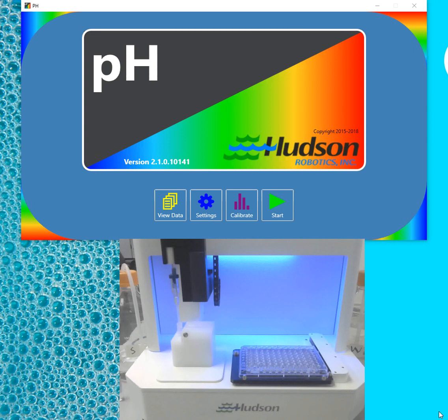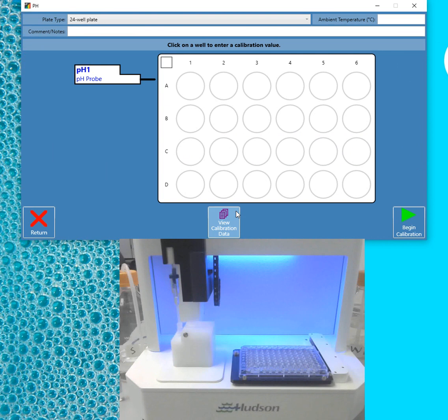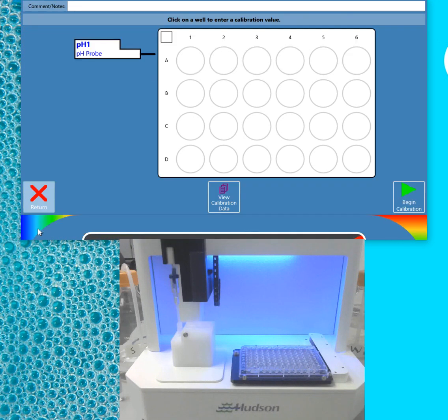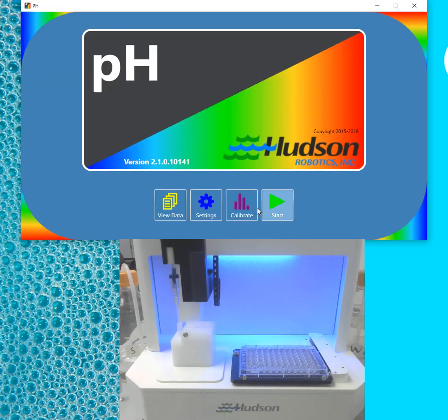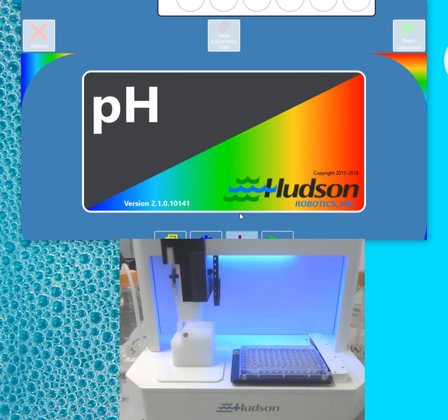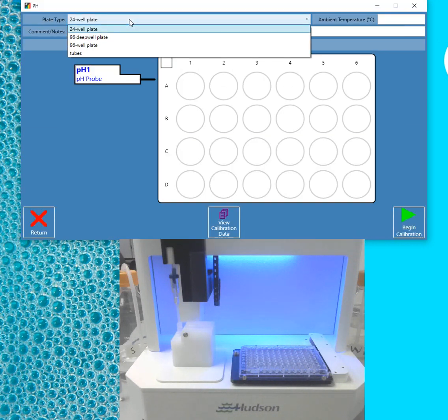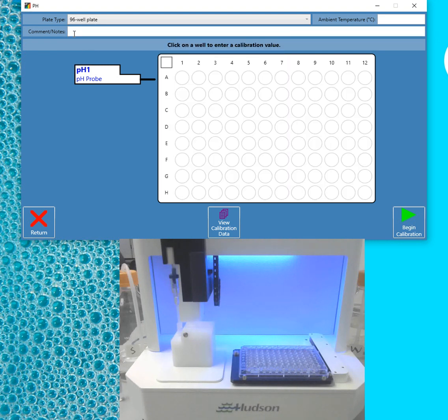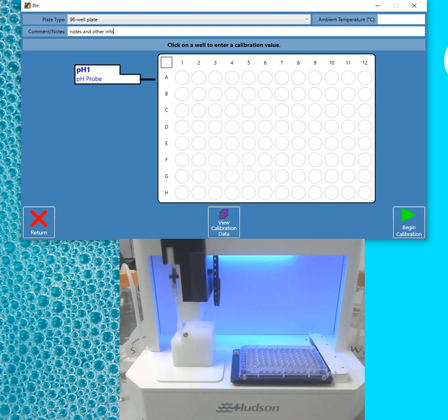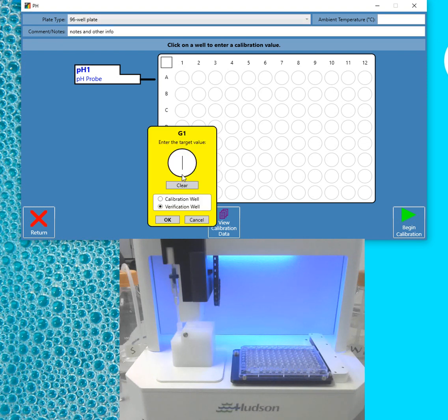So let's get started. First I'm going to step back one step. You can see how user-friendly the software is because it actually only has four buttons. I will click on Calibrate. I'm now going to pick the plate format that I'm currently using. If you want, you can add a note. And then you pick the wells that you're going to actually test your calibrations. So you have a verification option.